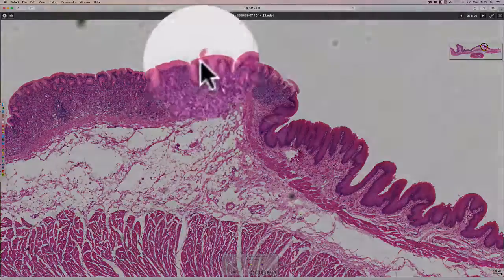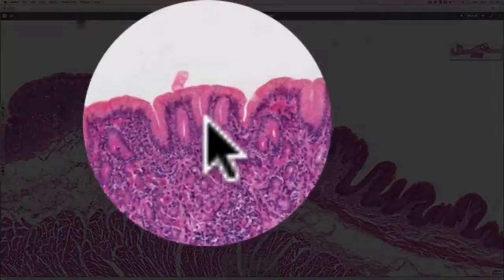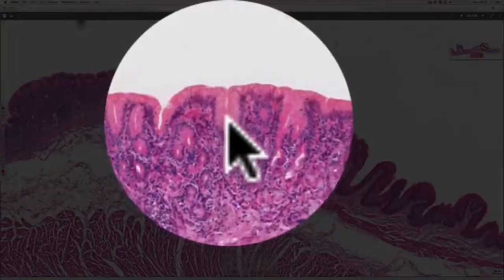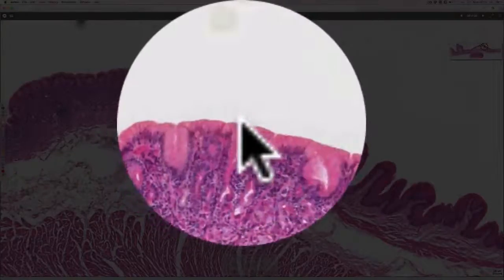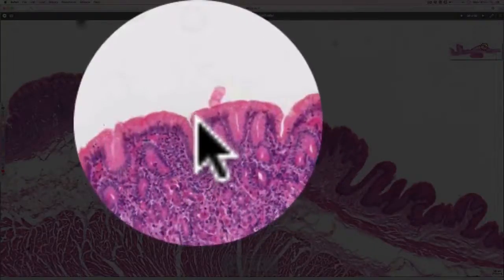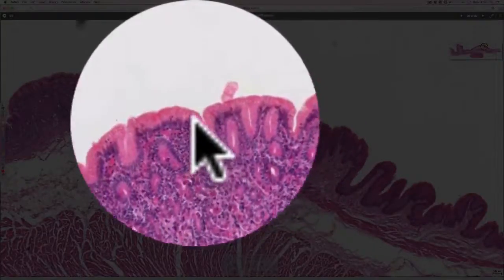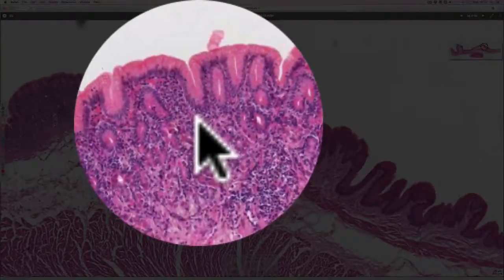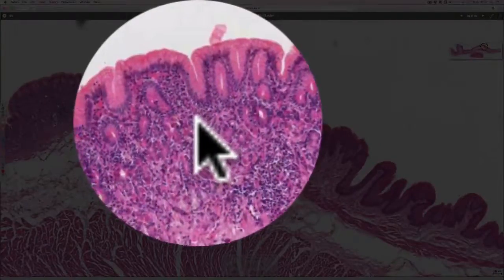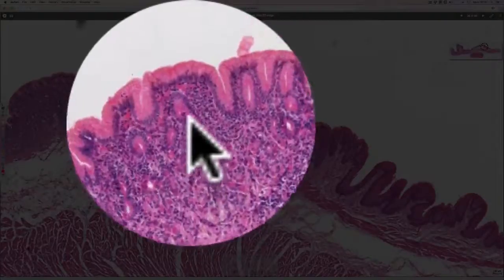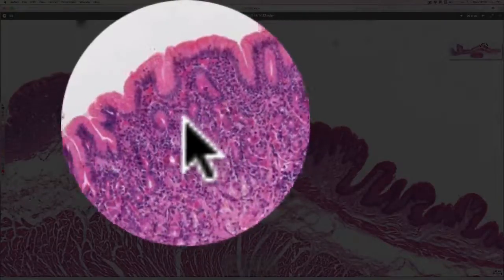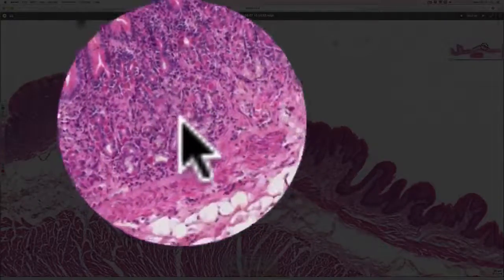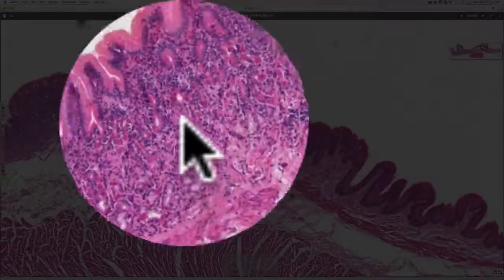We can see the surface cells — these pinky cells — which are the cells that produce the mucus of the stomach. Every so often there is a dip into a gastric pit, which leads into branched tubular glands, or gastric glands, that you can see in cross section extending all the way through the mucosa.